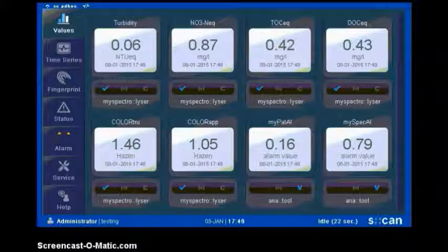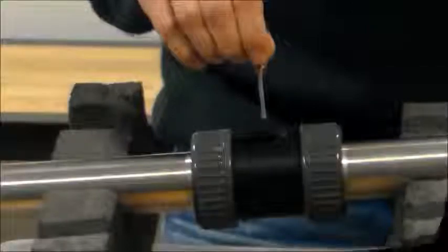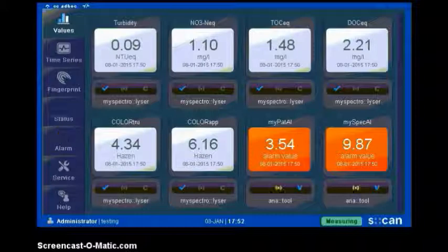The pattern alarm algorithm is going to have a hard time to distinguish the substances, but we are going to see if it's going to be possible. So we can see that both of the alarm algorithms were able to successfully detect the contamination with the cranberry juice, which means that they were able to distinguish between the relatively similar signals of orange juice and cranberry juice.